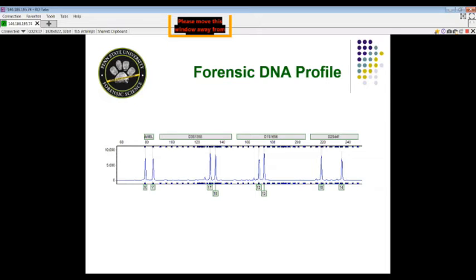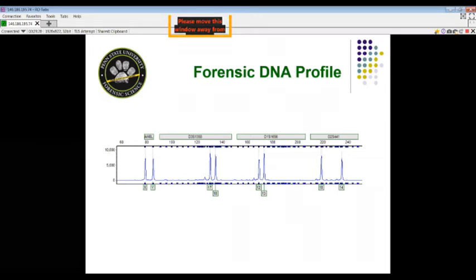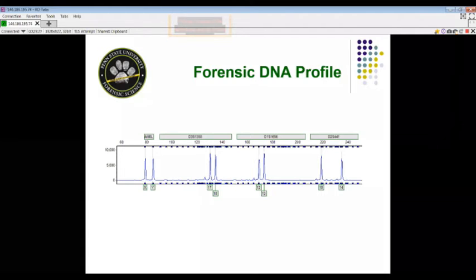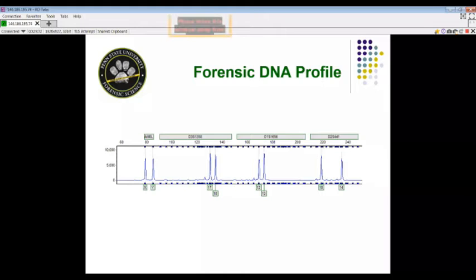So we use this information again, just like you saw in the gel image, to compare to references from victims or potential perpetrators of crime, and we'll make matches and then report back to the police and say that it seems like you have your person, and they then move to the courtroom and have a trial. But without electrophoresis, we can't do this. Electrophoresis is a core tool that we have in science and molecular biology in particular.